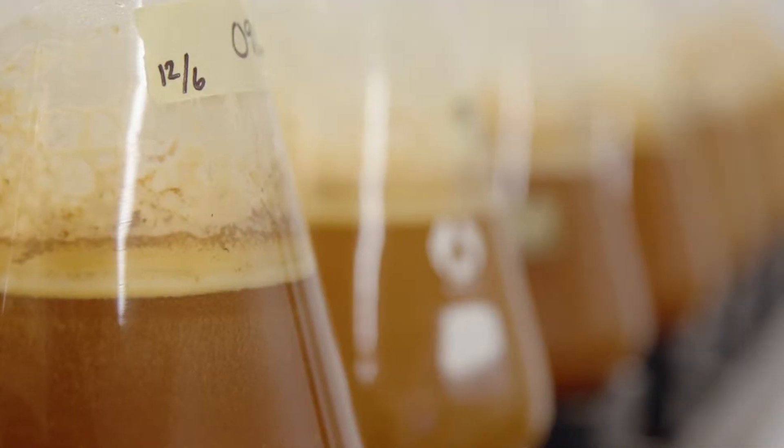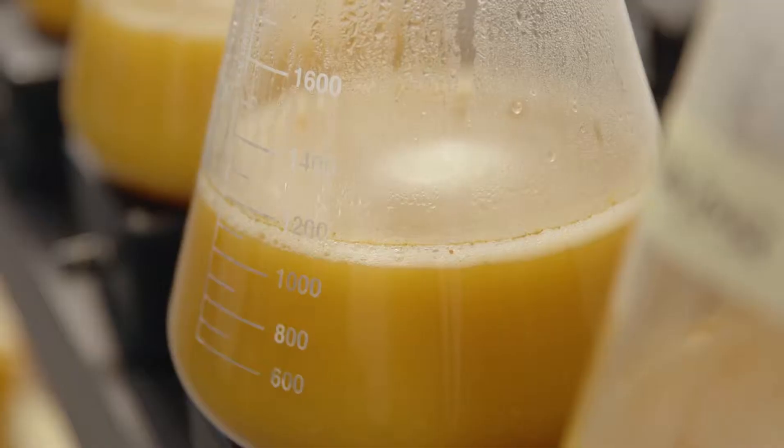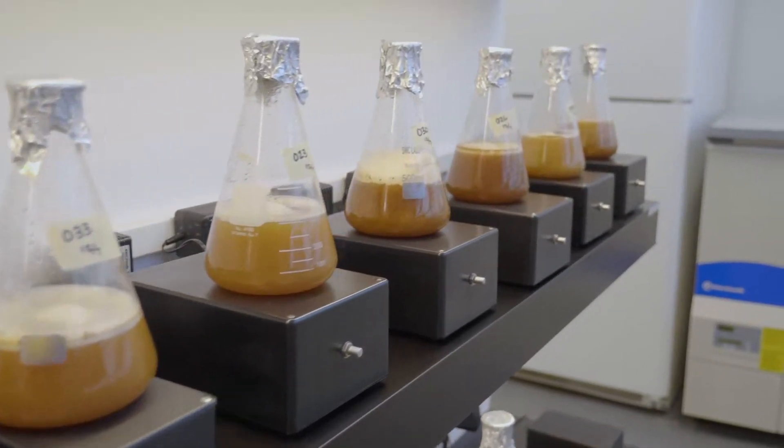You can use all sorts of different things to grow yeast, but it's almost like they have a memory. You want to grow them on what they're going to see, and they'll perform better for the brewer. Our entire process, we use wort — it's the medium that it's going to see when it gets to the brewer, so it performs best if we've grown it in that same medium. All these little yeast cells are all excited — they're about to be consumed. We're taking them from a million cells to trillions of cells in a matter of five or six days. It's amazing to really think about how we've culturally, as human beings, captured these single-celled organisms to do all these wonderful fermentation tasks for us — and unwittingly, essentially. We didn't know what they were until the late 1800s, but we've been using yeast for millennia.